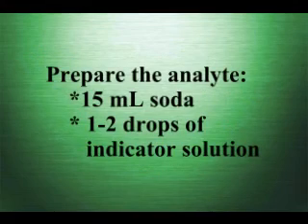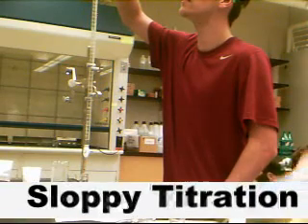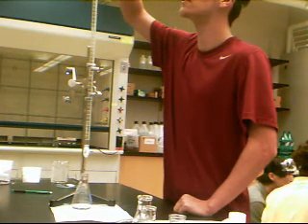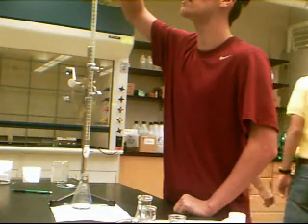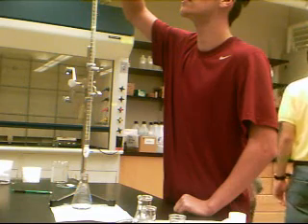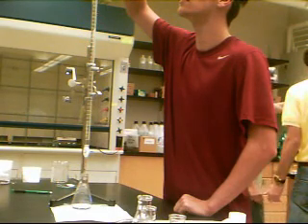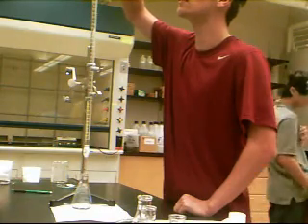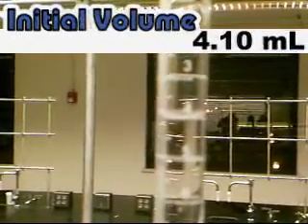Add the analyte and one to two drops of indicator solution to an Erlenmeyer flask. To begin, we will perform a sloppy titration in order to find a rough estimate of how much sodium hydroxide will be needed to reach an endpoint. In order to calculate the concentration of the citric acid in the soda, we must determine the volume of sodium hydroxide it takes to neutralize the soda solution. Make sure the valve on the burette is shut, then fill the burette with your titrant. Record the initial volume of the titrant to two decimal places. In this case, our initial volume is 4.1 milliliters.